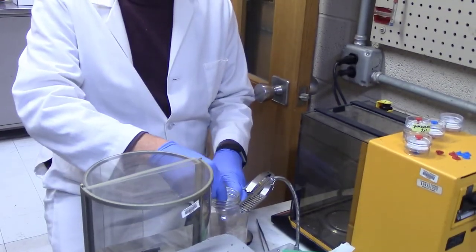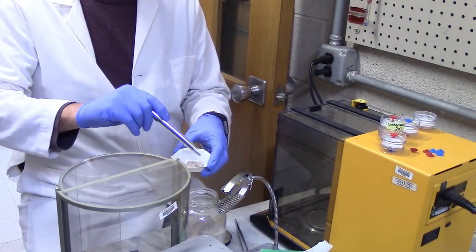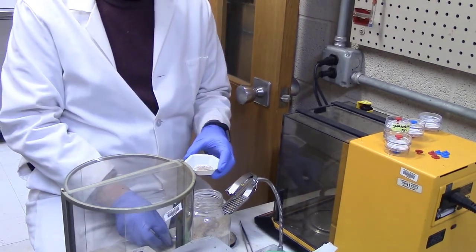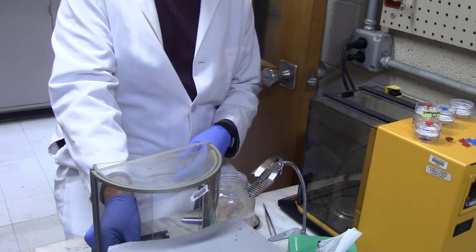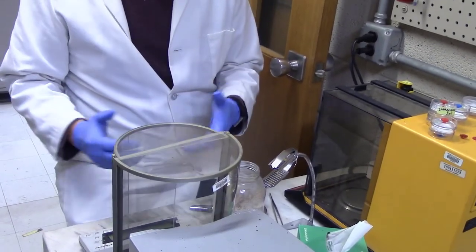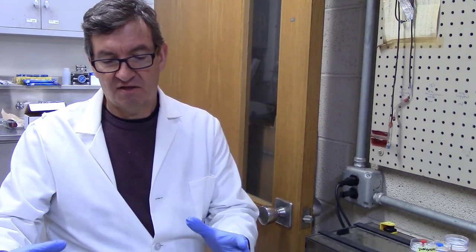So one of the hazards that we face in our lab is handling powders, and you can experience that when you're trying to weigh them out to get the correct amount for an experiment. If you're doing some weighing, you're transferring some material from a container into maybe a weighing boat, and there's a possibility that this could lead to an exposure if this were a particularly lightweight material that could become airborne. So in the process of weighing, we have concerns that if there's something particularly toxic or particularly small like a nanomaterial, that we may need to contain this microbalance within some sort of ventilated enclosure or even within a laboratory hood. I'm working with a test dust now that isn't particularly toxic, it's made of clay, so I don't need to worry about that too much, but in other situations you may need to be a lot more careful with your handling of powders.